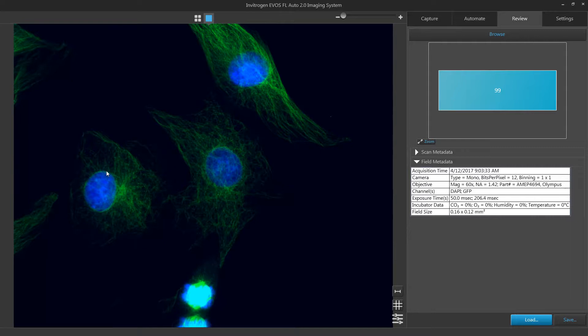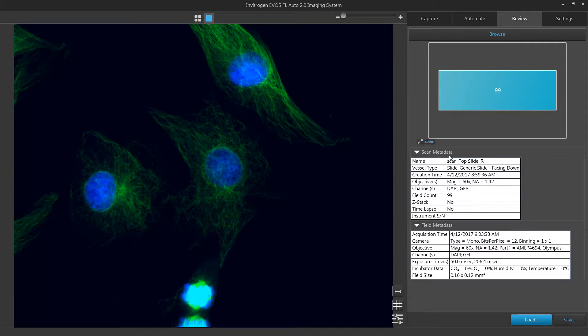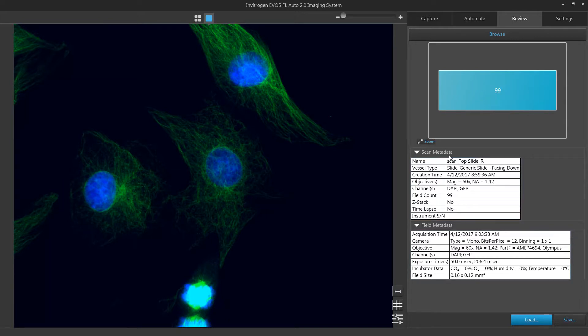On the right side of your image you will see a field and scan metadata. This will display information like channel settings used to capture the currently selected field or the entire scan.